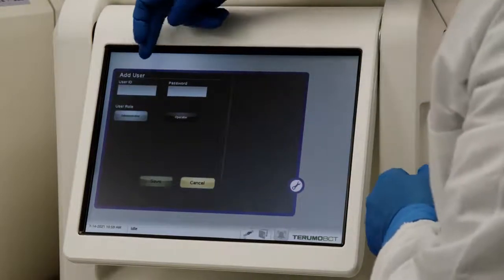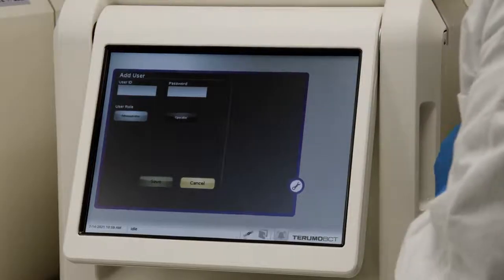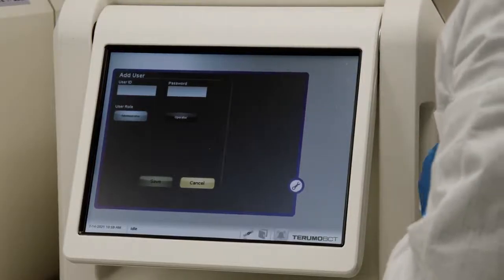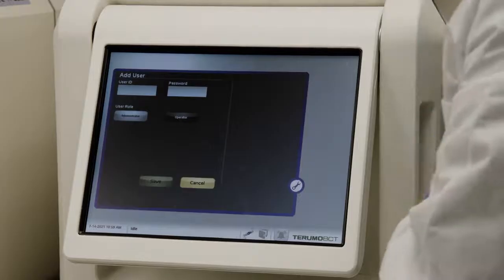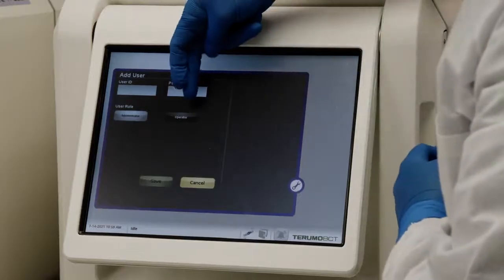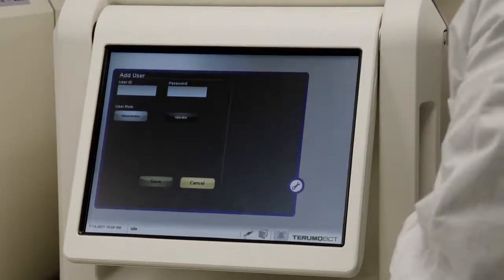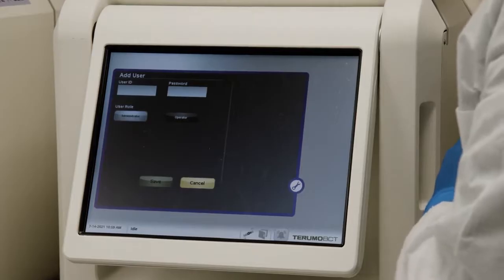The unique user ID here can be a company ID or an extension number and each can have a unique password. You can assign either an operator role or an administrator role to this user depending on how much autonomy they need in their role.